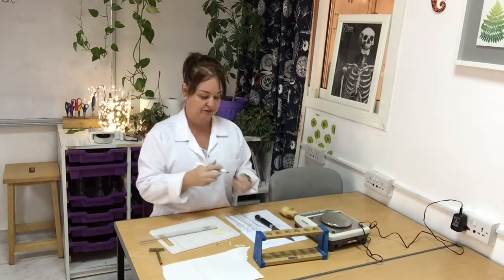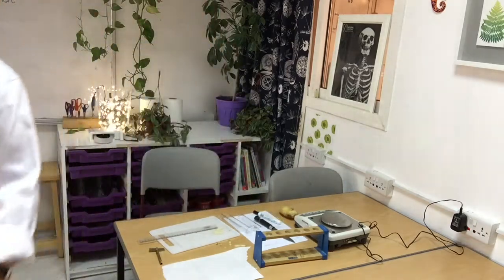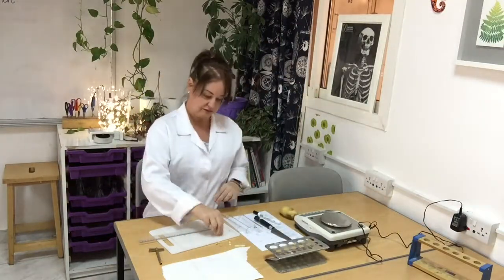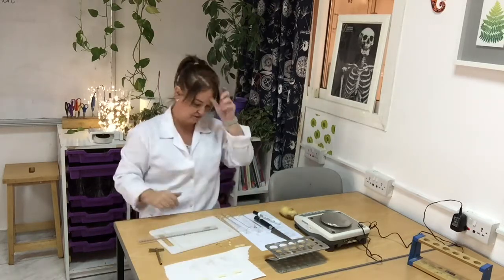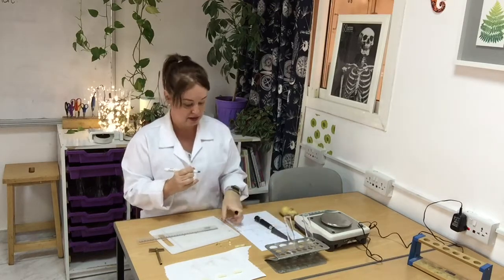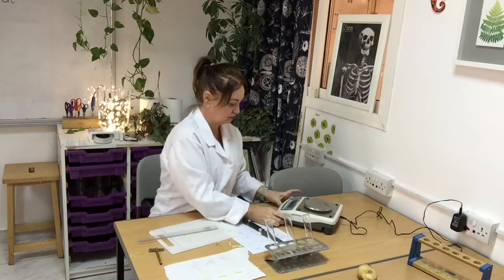Okay, we need to make sure, of course, that your boiling tube actually fits in your test tube rack, so I'll go and get another one. Okay, so now I've got a boiling tube where my boiling tubes will fit. I'm going to take each potato cylinder, roll it gently on some paper tissue to ensure that any excess moisture is removed before I measure its mass. I'm just labelling my boiling tubes there, A, B and C.